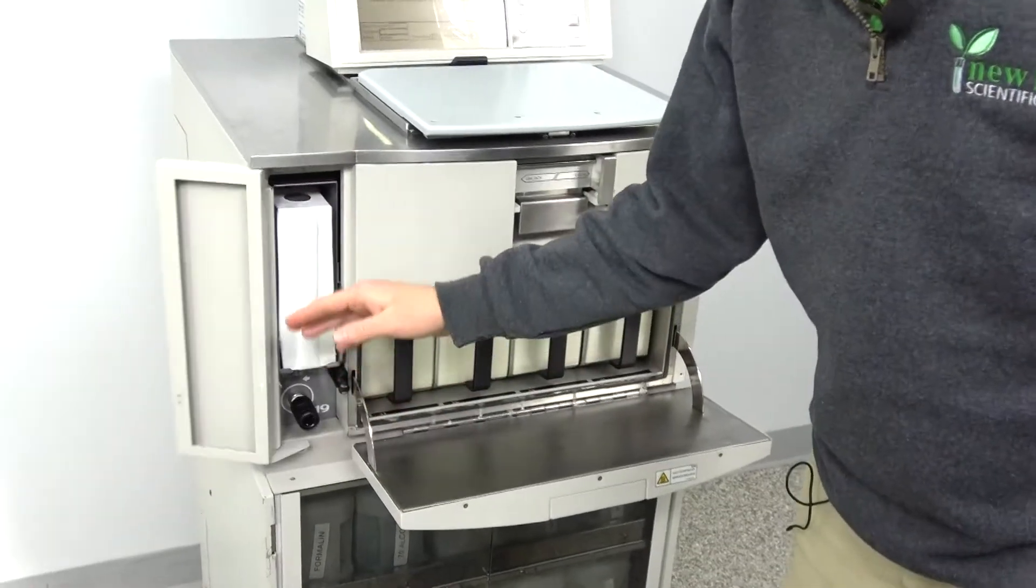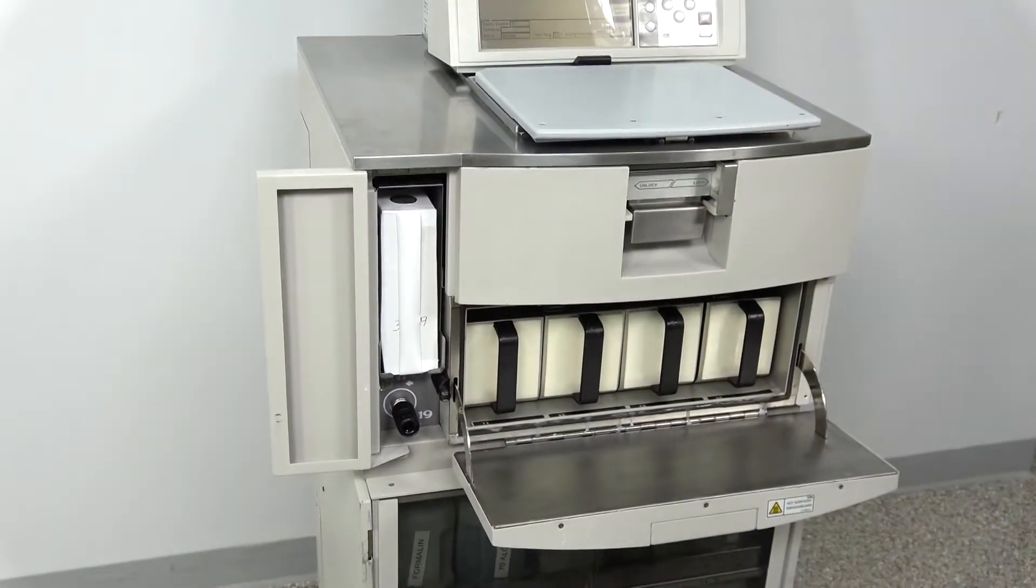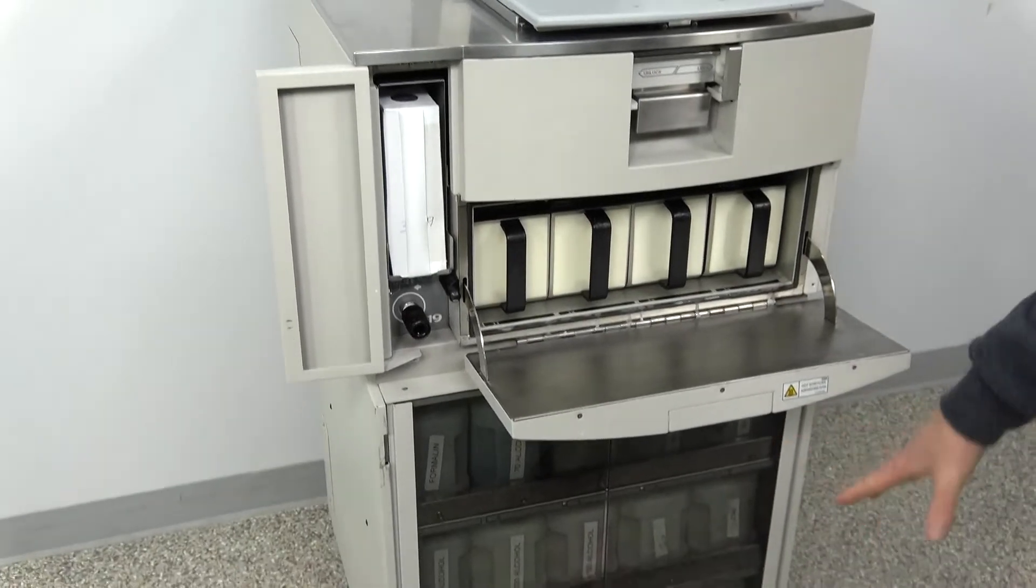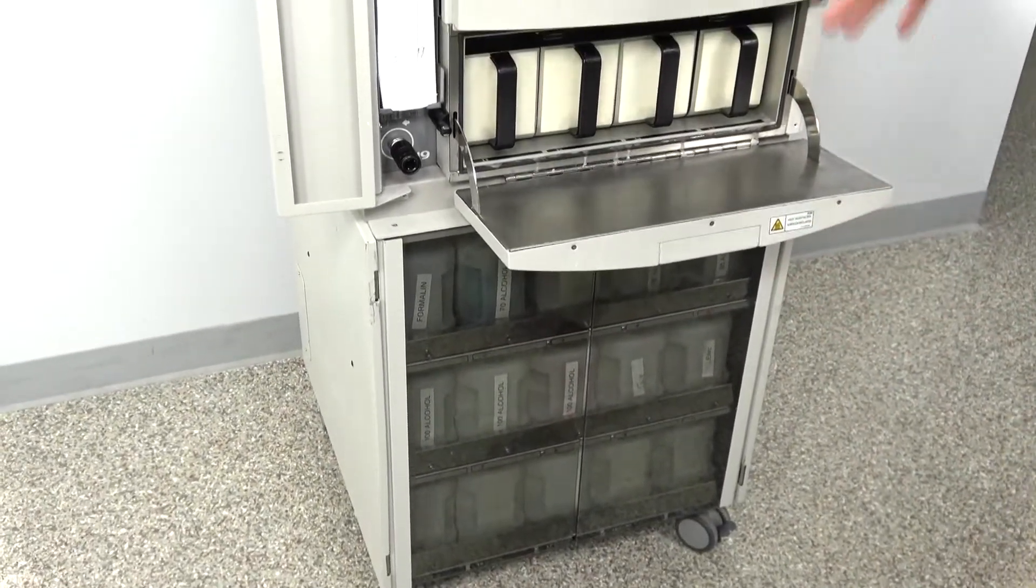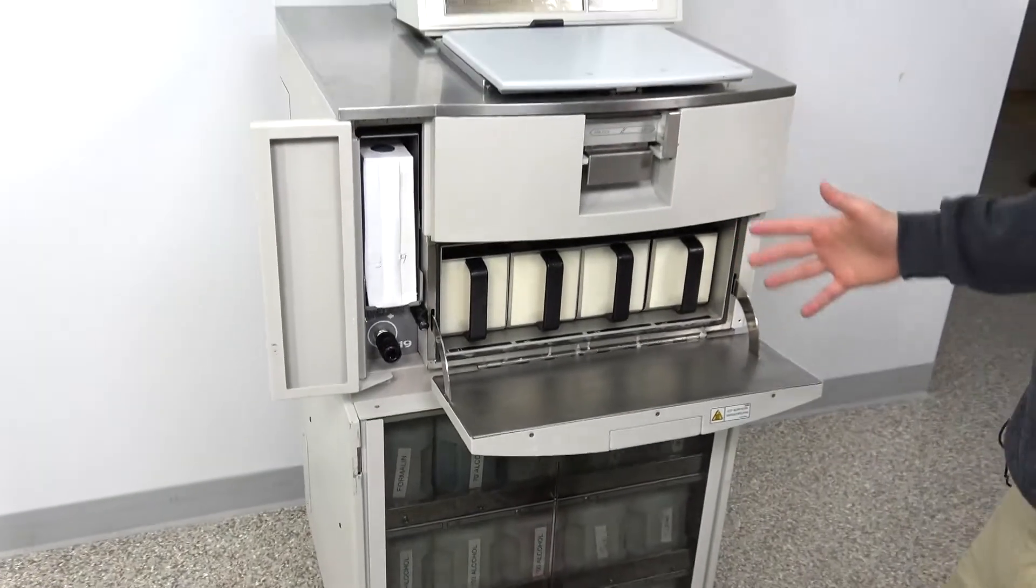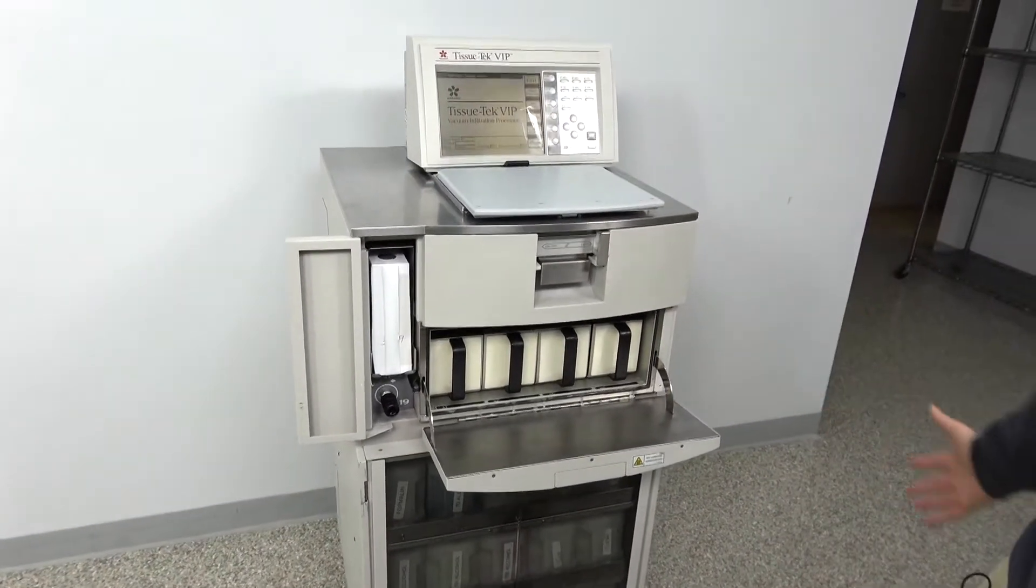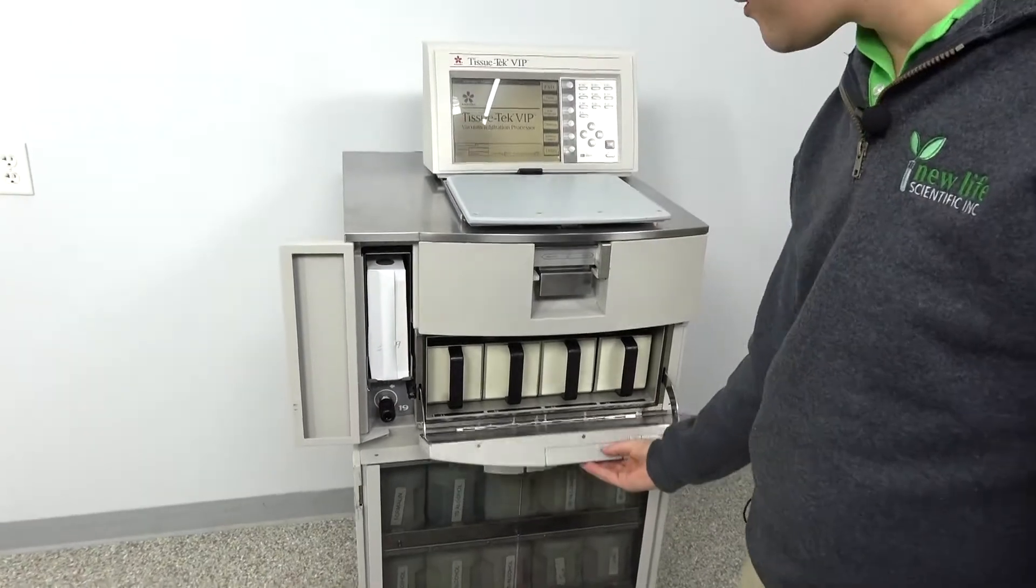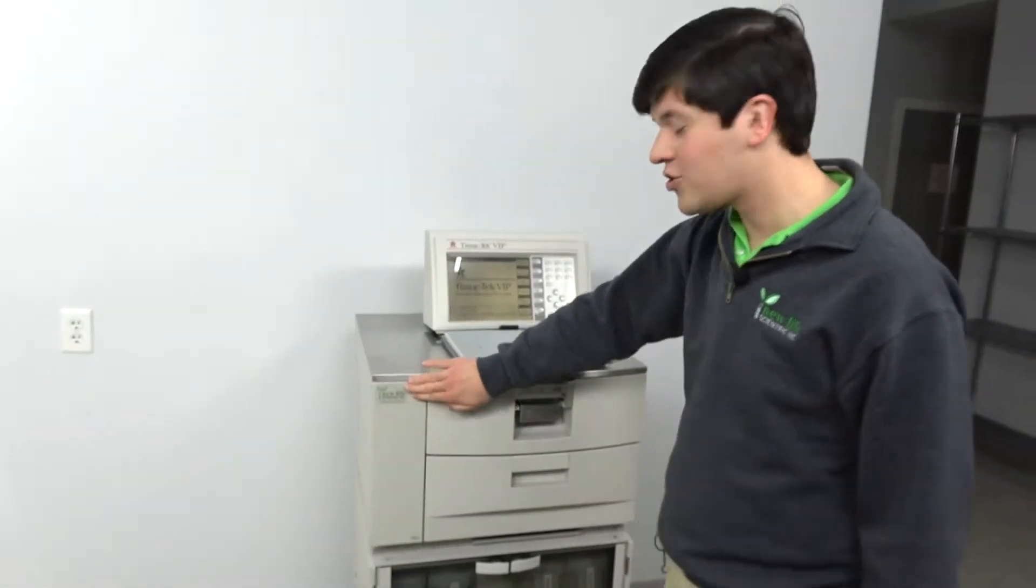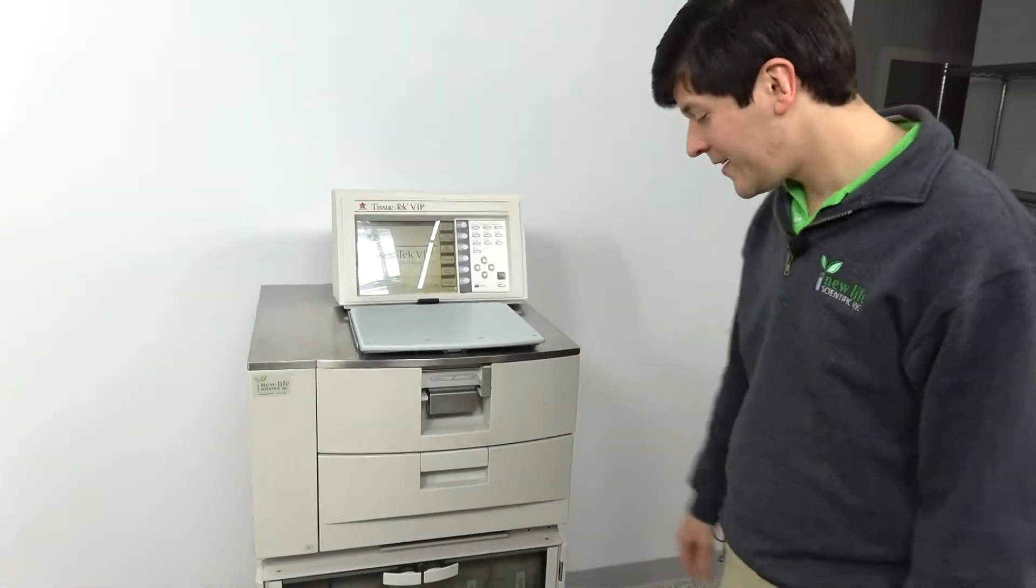Our techs did move fluids, water from every single bottle in here, in and out, just to make sure that the pumping action was working. They've also moved wax in and out of the retort, so the pumping features are working fine. They've not noticed any leaks in the rotary valve, and this has actually gone through multiple cycles just to ensure that the whole system is functioning properly.